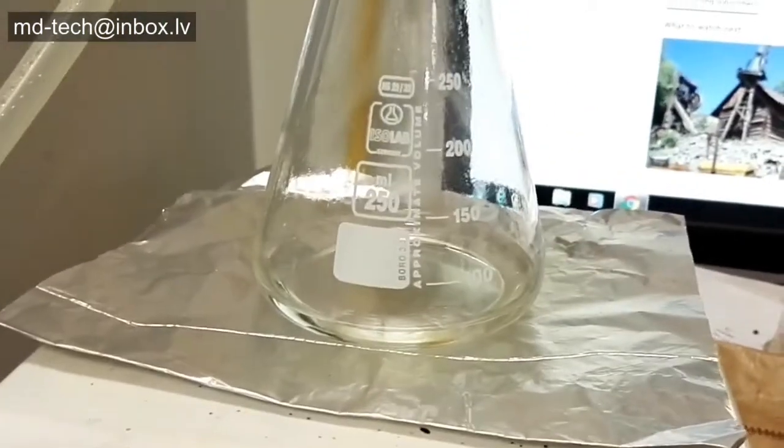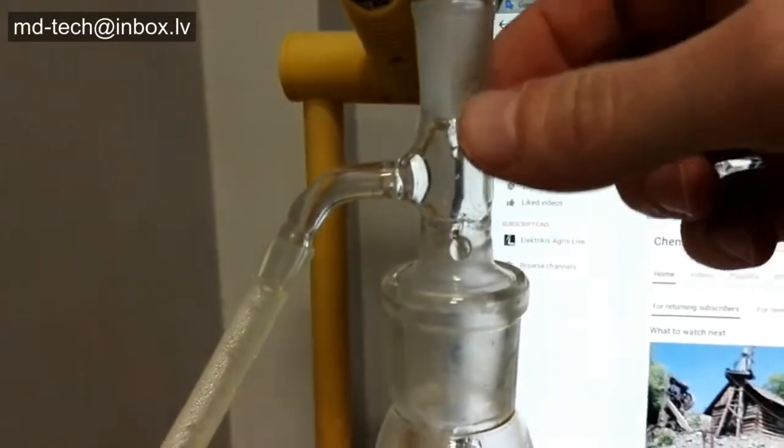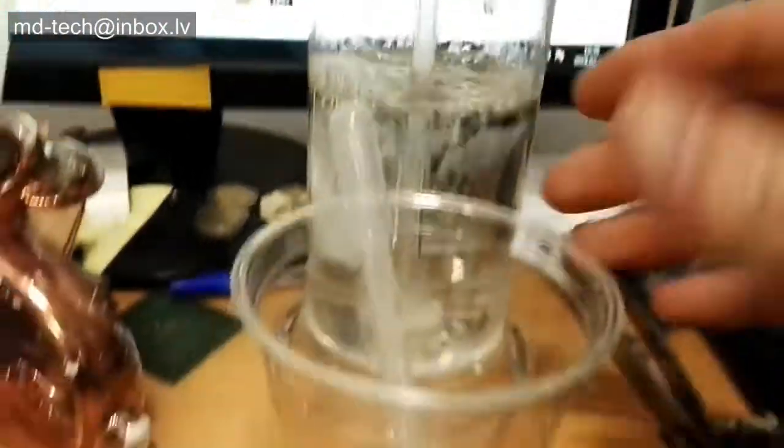Use only professional gold refining equipment and reliable safety equipment when dissolving gold and other metals in aqua regia. Always use a fumed hood with an appropriate scrubber when refining gold or other precious metals.